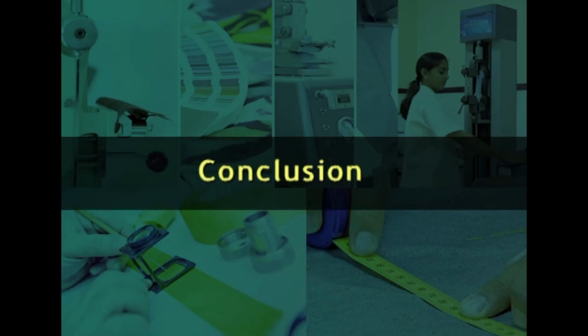By now, you might have understood the different test procedures generally followed for color fastness and the evaluation methods that are followed after color fastness. Color, as we have learned, is very important to the consumer and to the textile designer who does the coloring. This all depends on the end use of the fabric for which the color or the material has been applied. Color contributes to making a fabric a bestseller in the market.